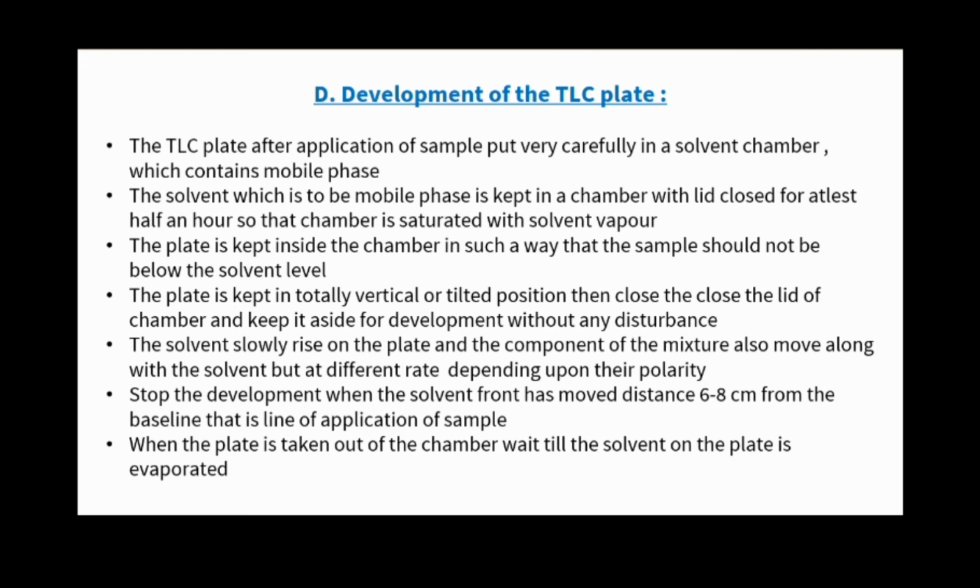The solvent slowly rises on the plate and the components of the mixture also move along with the solvent, but at different rates depending upon their polarity. Stop the development when the solvent front has moved a distance of 6 to 8 cm from the baseline, that is the line of application of the sample. When the plate is taken out of the chamber, wait until the solvent on the plate has evaporated.